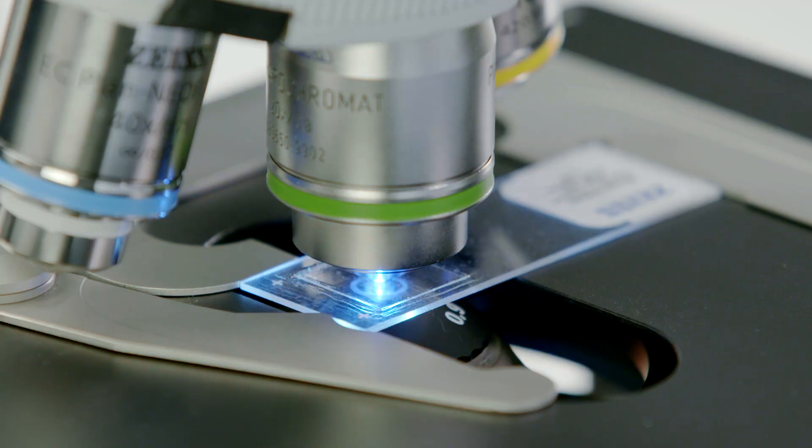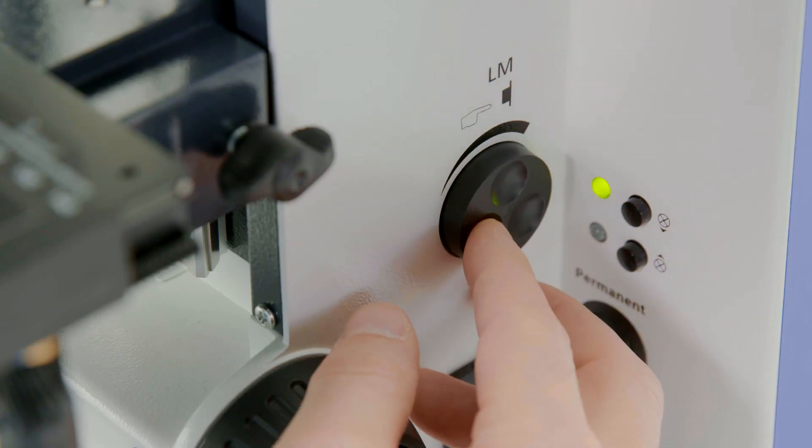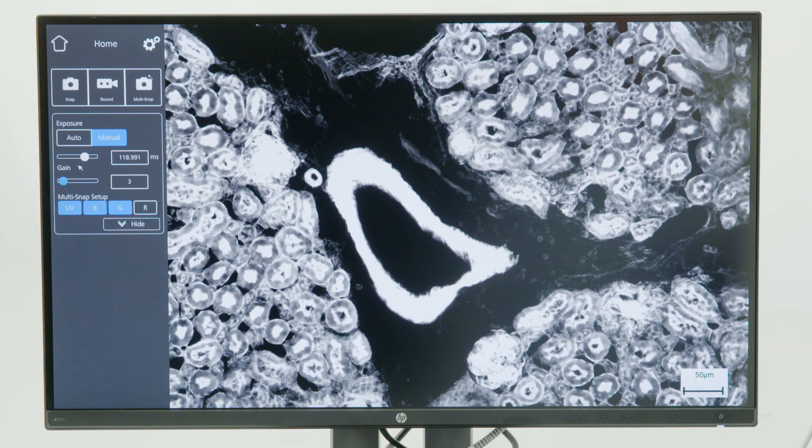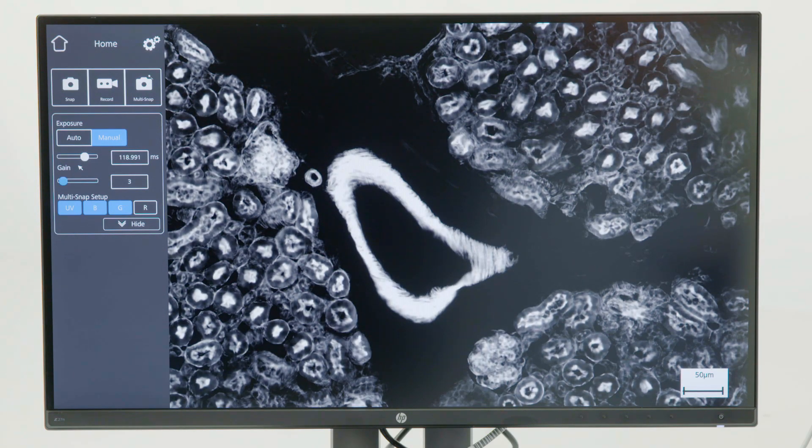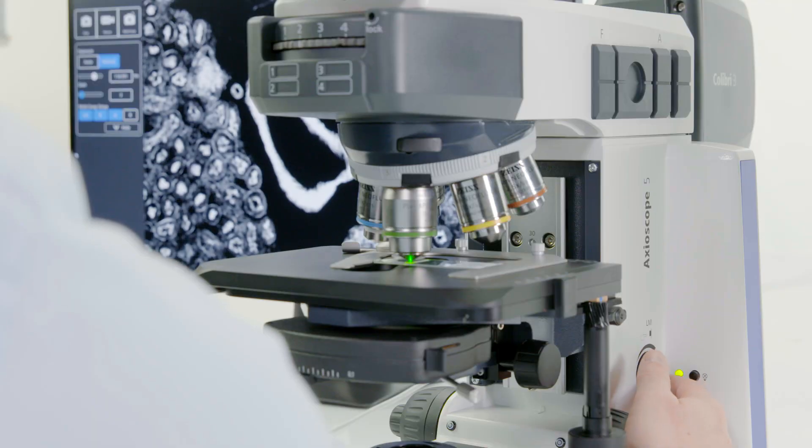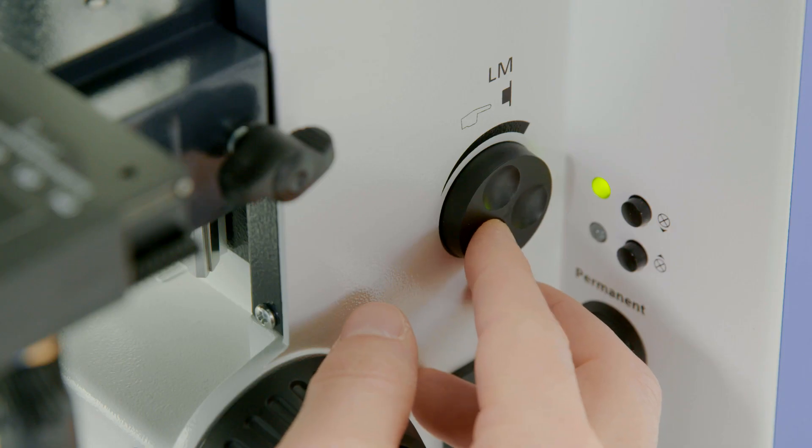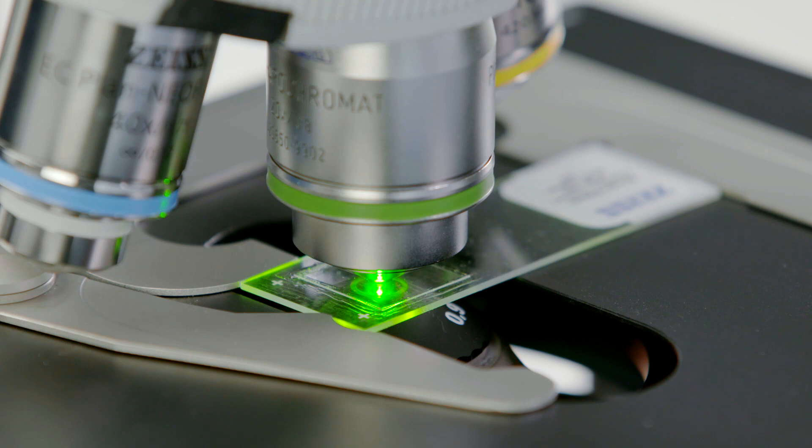Toggle to the blue LED and adapt the LED intensity with the light intensity button on the microscope so that the fluorescence signal on the monitor looks good and is not overexposed. Toggle to the green LED and do the same.